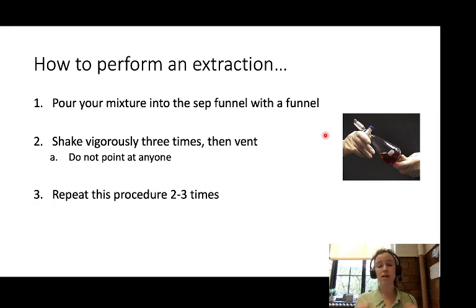Then repeat that a couple times. Shake, shake, shake, really vigorously, vent. Close it. Shake, shake, shake, vent. Close it. Then your separation will happen beautifully.